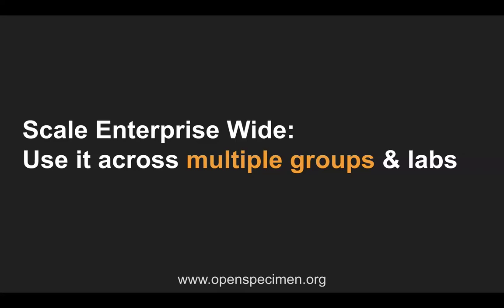Multiple groups should be able to use the same instance of OpenSpecimen, where each group can see only their data but not others' data. So the more people using it in your institute, the better, because then the cost gets amortized across multiple groups. And also, for your group, you are not the only one managing the system.